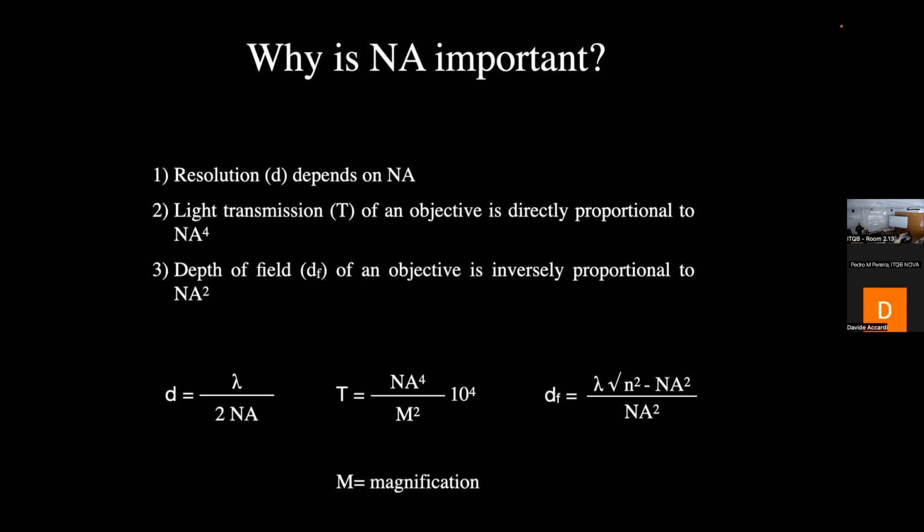Because if you want to observe, for example, a brain slice of 50 microns, and you are using a wide field system with a 20x lens that has a depth of field of approximately 1 micron, you will see lots of blur. You will have a single micron in focus, and all the almost 49 microns above and below the focal plane will contribute blur to your image. If you use a 5x lens that has a depth of field of 50 microns, you will see everything in focus and the image will look all sharp. So this is another consideration that needs to be made.